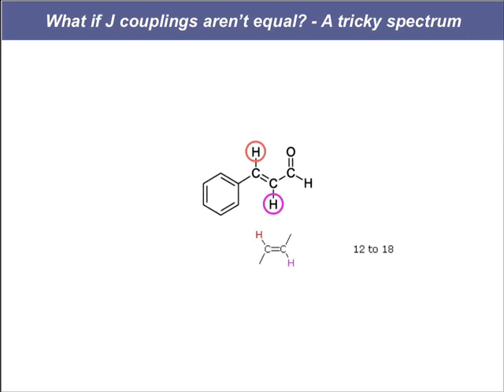That relationship has a 12 to 18 coupling constant, which means this will be approximately a 15 hertz doublet. That's a doublet that is twice as wide as the other doublets that we've seen. Our normal doublets are about 7 hertz. This is going to be 15. So these are going to be two peaks at equal heights that are separated by 15 hertz on our spectrum.